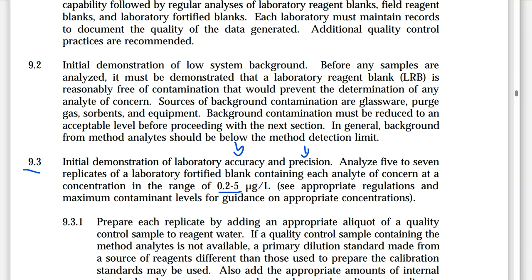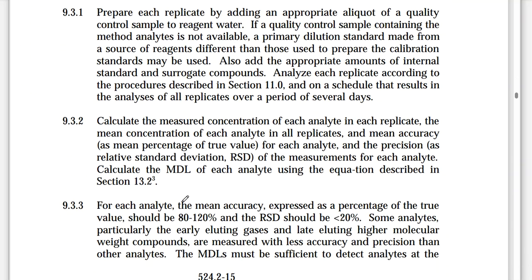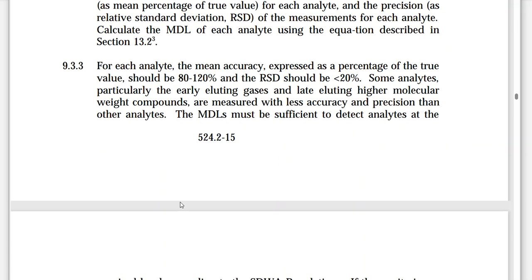So let's just keep on cranking it. Let's keep on churning it out. And I think that will be pretty good as long as these types of things are still upholding throughout the analysis run. Okay, so it goes through and it tells the QC department on some of these thresholds, some of these requirements that they would need in order to pass what we would call a batch.